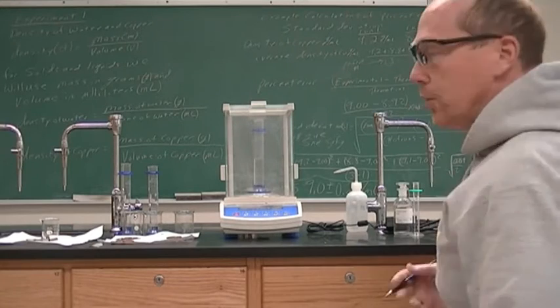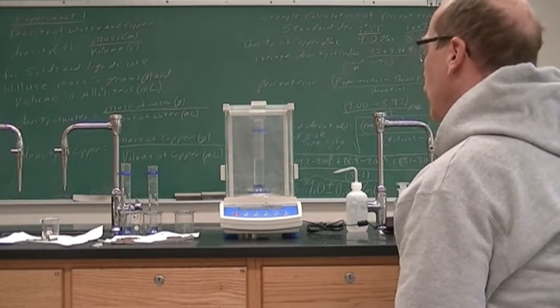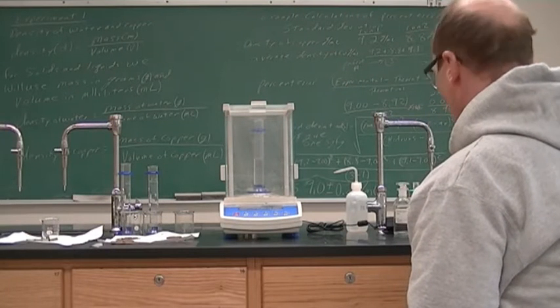So now the mass of the graduated cylinder and the water is 109.2267.